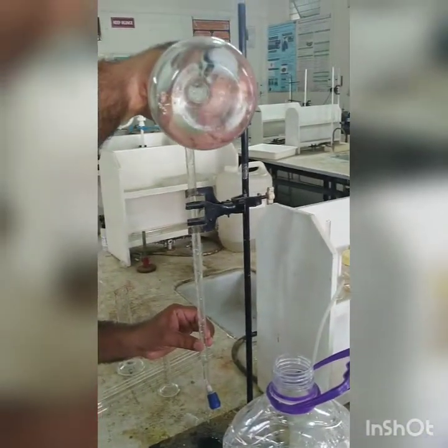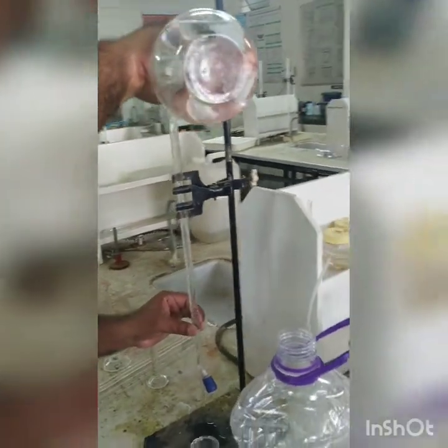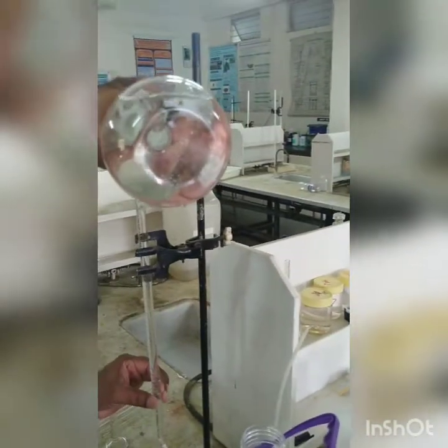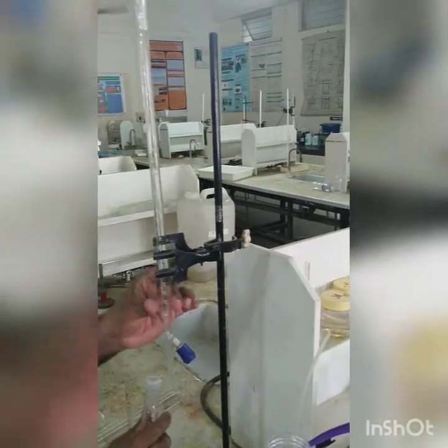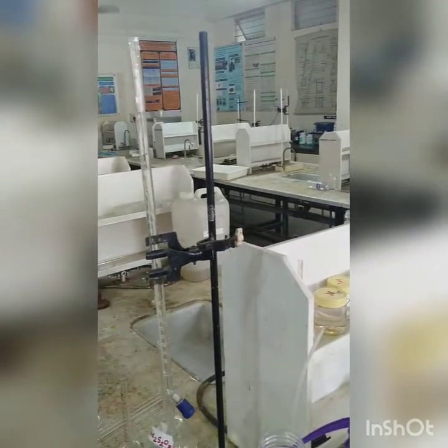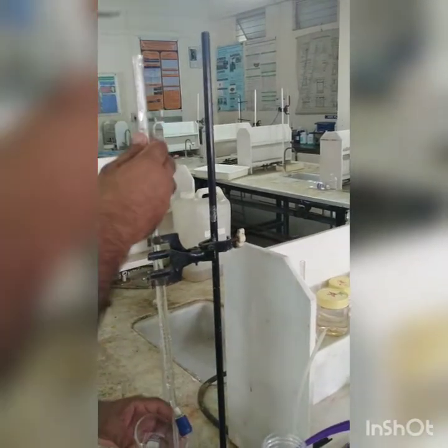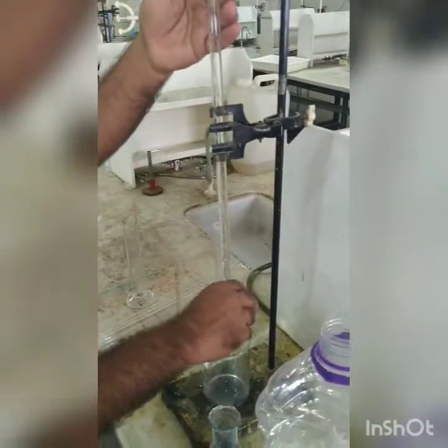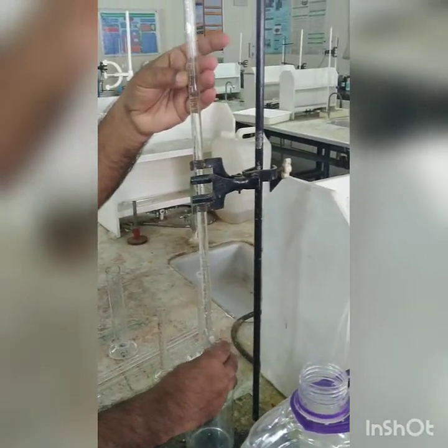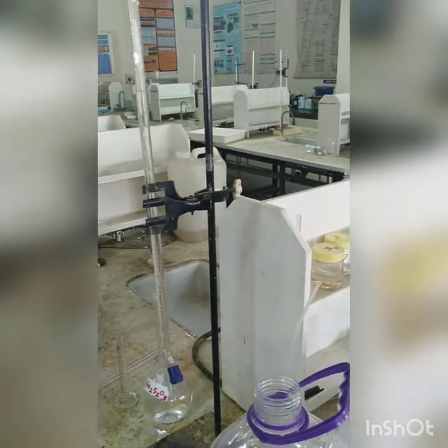Now adjust the initial reading to 0. Waste some sodium thiosulfate from the lower end also. Ingole sir, you can take some beaker there. No, don't take it into that. No, use the other one. Take some beaker or anything. Then waste it from the bottom so that the rinsing will be complete. You can throw it away.